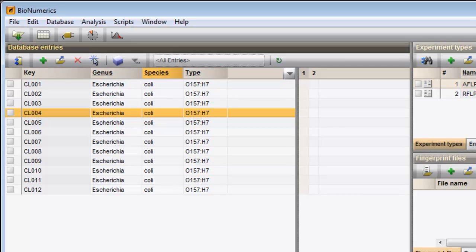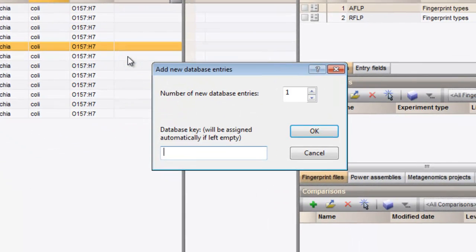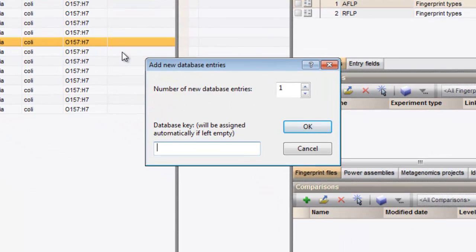Entries can be added to the grid by right-clicking in the panel and selecting Create new entry. A dialog box appears, asking for the number of new entries to create.